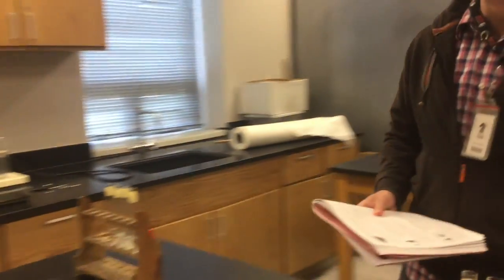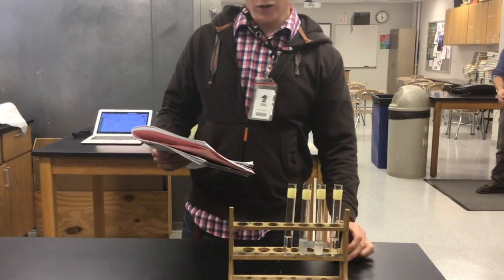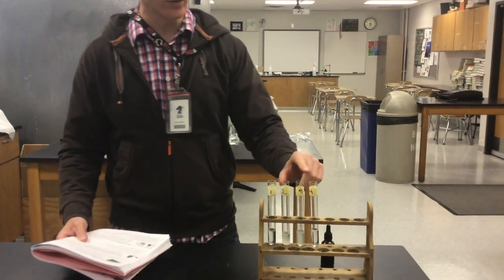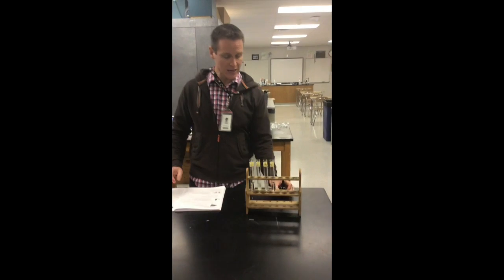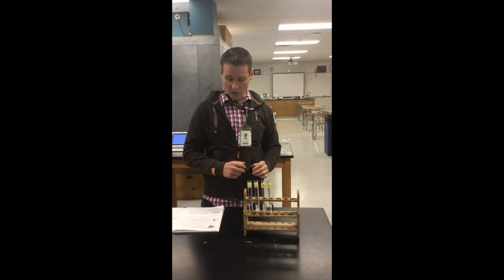Let's go on to the next test. The next test is the carbohydrate test, and we are going to use iodine for this one. So we got our 4 unknowns in there. You'll notice they're labeled 1, 2, 3, and 4. I don't know which ones contain starches, which are long chain carbohydrates, but that's where the iodine comes in. Iodine will change color in the presence of starches.